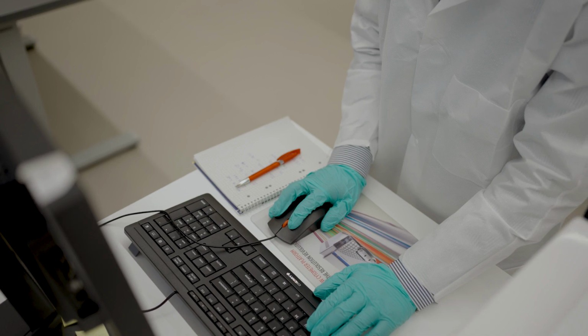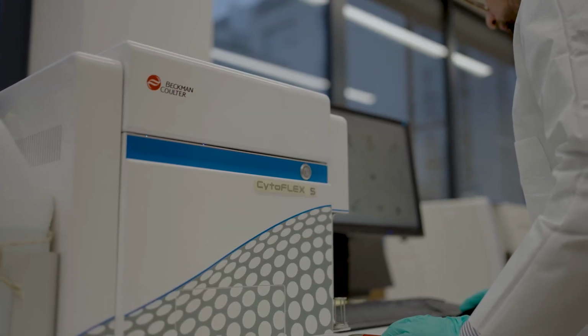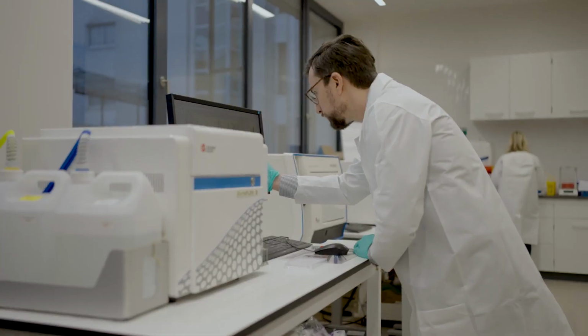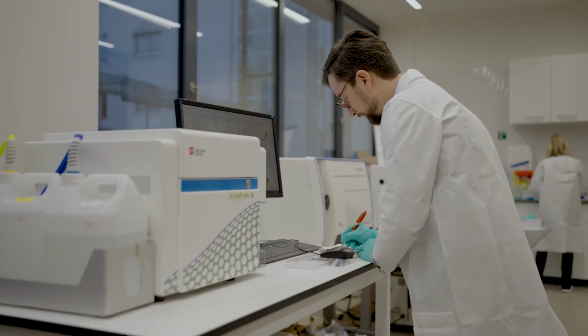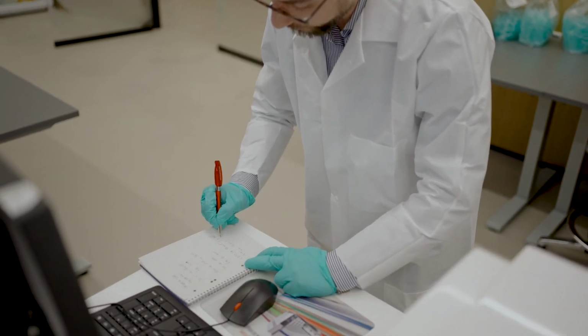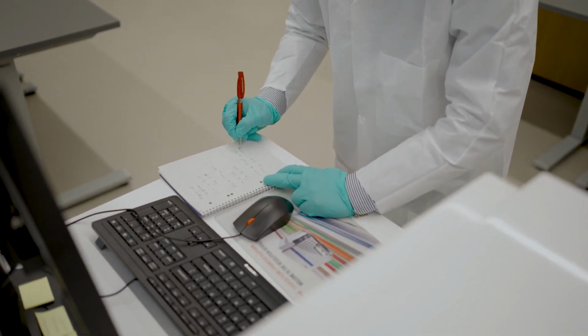I have been using spectral flow cytometry for 2 years to increase the number of detectable markers in T and B cell lymphocytes in different settings, such as lung or skin cancer. The CytoFLEX Mosaic spectral module is so easy to use. Being familiar with the CytoFLEX software, within 2 hours you are ready to use the spectral mode with Mosaic. CytExpert for Spectral retained the familiar, intuitive interface of traditional CytExpert software while significantly expanding its functionality.